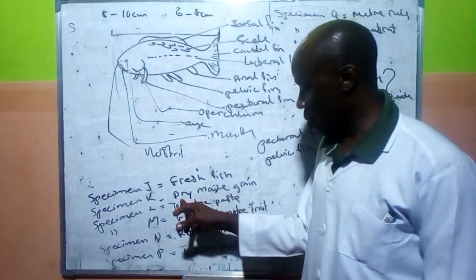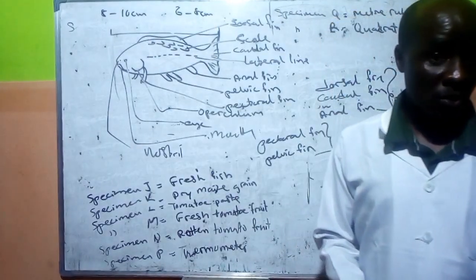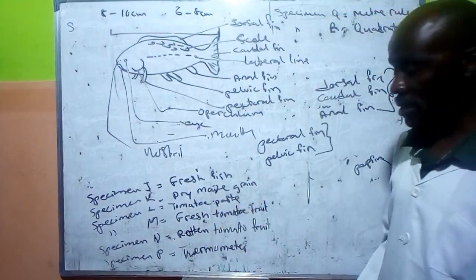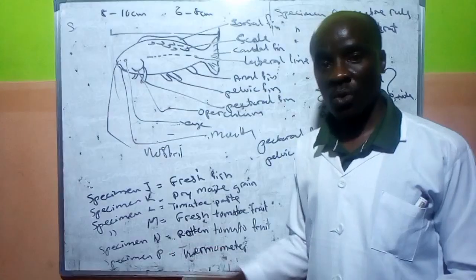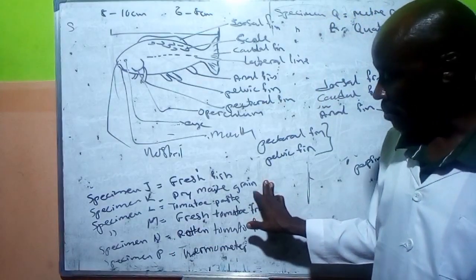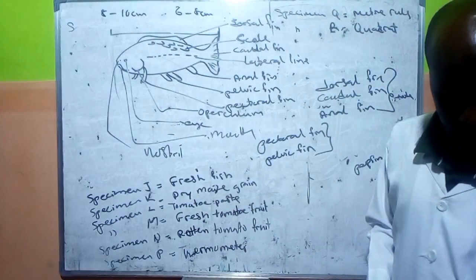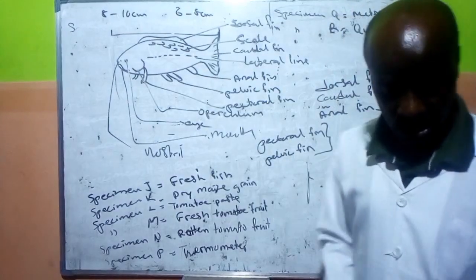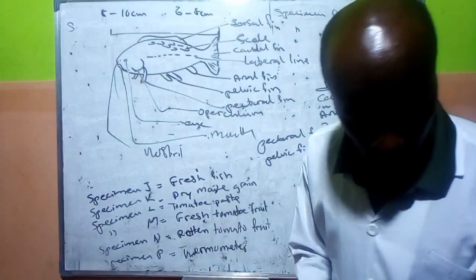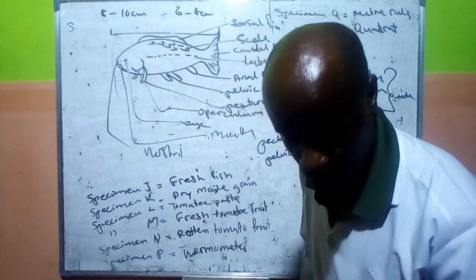So in this place, we can also look at testing for starch, because iodine will also be provided. Crushing this maize and then dropping iodine on it will turn it blue-black, confirming the presence of starch. Then for the tomato paste, we'll go over to that place. We need Benedict's solution there, because we should be testing for sugar. So that is with the paste.